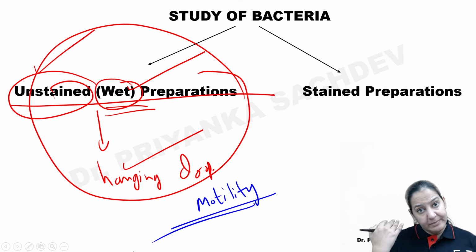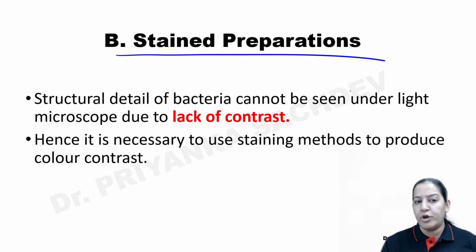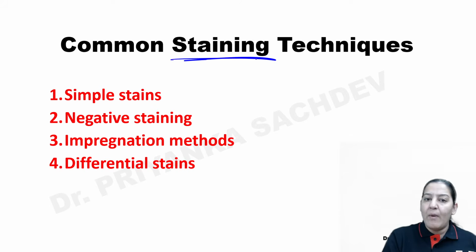Coming on the stain preparation. Why staining is required? I have already taught you. The staining is required because of lack of contrast. Because the bacteria is transparent, the slide is also transparent. That's why there is no contrast and you cannot see it. Without contrast, you cannot see it. That's why you require stains.